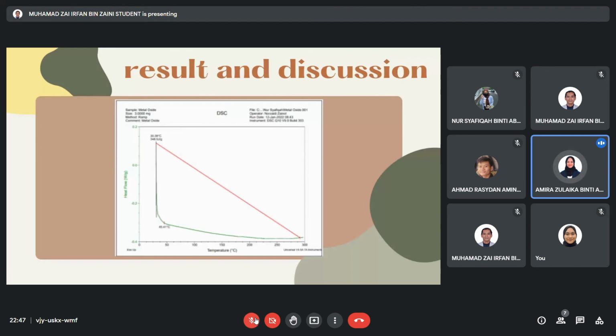Thermal imbalance between the sample and the calorimeter's reference creates baseline drift, which causes minor changes in baseline position over the course of an experiment. As the temperature rises above the research material's critical point, baseline drift stops at 298 degrees Celsius.